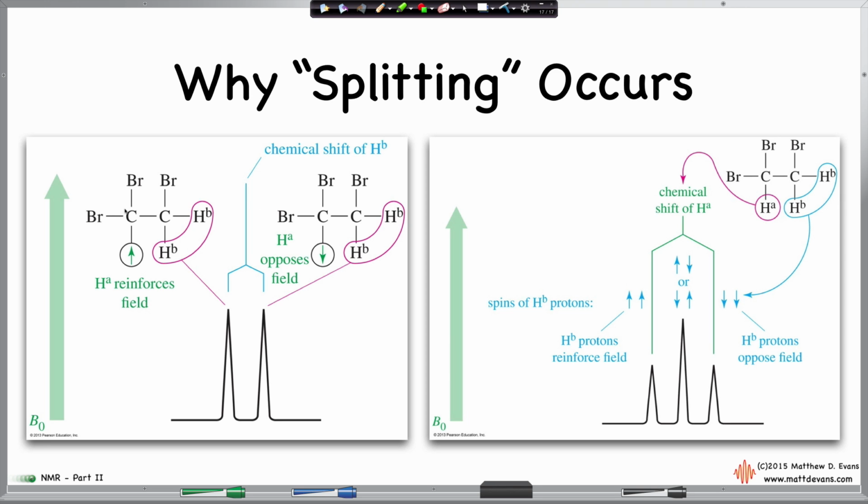It's got a bunch of bromines, which don't show up in NMR. Only the hydrogens do. This is a hydrogen right here, even though they didn't write in hydrogen here. It's a hydrogen atom. And when we're looking at the signal, and this is the confusing part, so we really have to concentrate when we look at this. These 2 hydrogens right here with 1 neighbor hydrogen, it's predicted to be a doublet for this one signal with 1 neighbor. So that's exactly what we see here. It's a doublet for these 2 hydrogens. These 2 hydrogens are 1 signal, and they're a doublet because they have 1 neighbor.